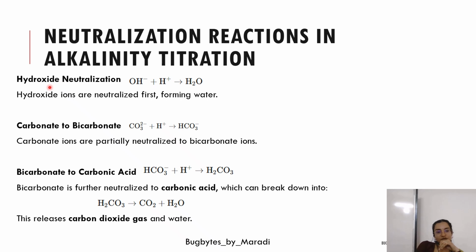First thing, it will be your hydroxide neutralization. I have to neutralize hydroxide. The water sample contains NaOH; I have written only the OH part of it. And I'm titrating it against sulfuric acid, that is H2SO4, or hydrochloric acid, that is HCl. So it is your proton over here, nothing but H plus. So you have an acidic one as well as the basic one, OH minus as well as H plus.